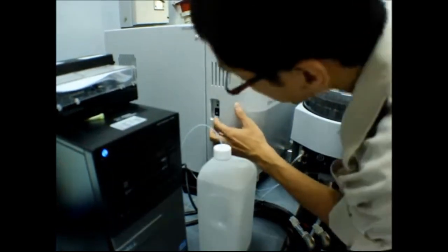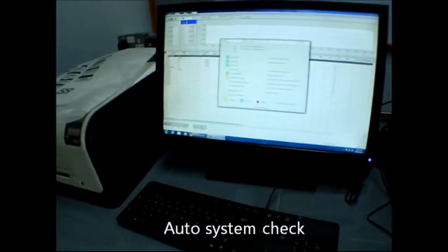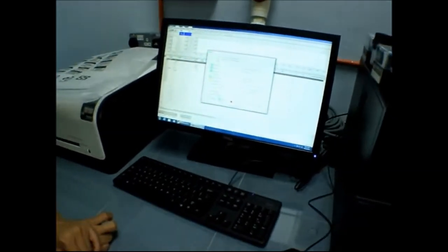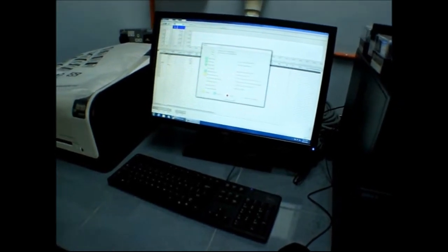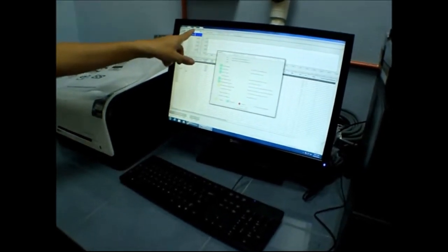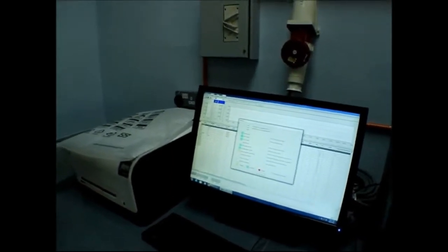It's connected. Requirement. Okay, this is red. Disconnect. Done. This one, because we use a template, we just call out the template. Then I need to connect it from here, not from here. This one is when you do setting, then they will ask whether you want to connect or not. So it's slightly different.